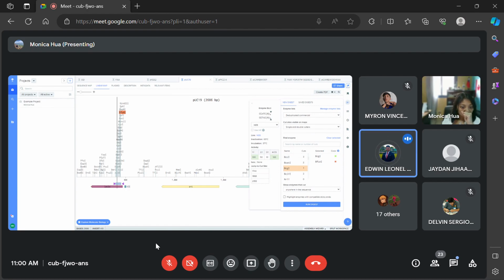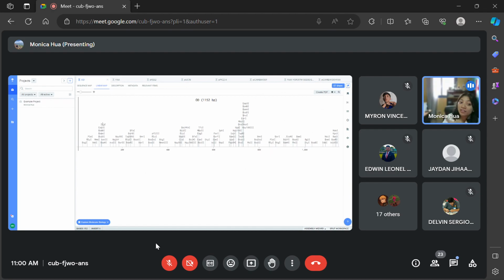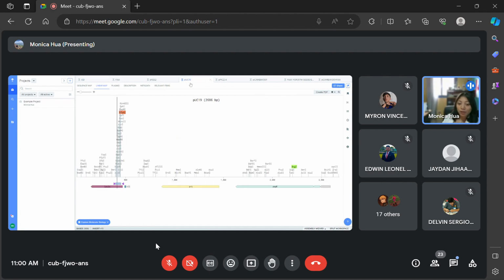Wasn't it supposed to have none? I'm getting a bit confused now. No, on the plasmid. I'm in PUC right now. On OD, it's supposed to have none. But on the plasmid that you choose, from the multiple cloning site, you're still not done selecting.